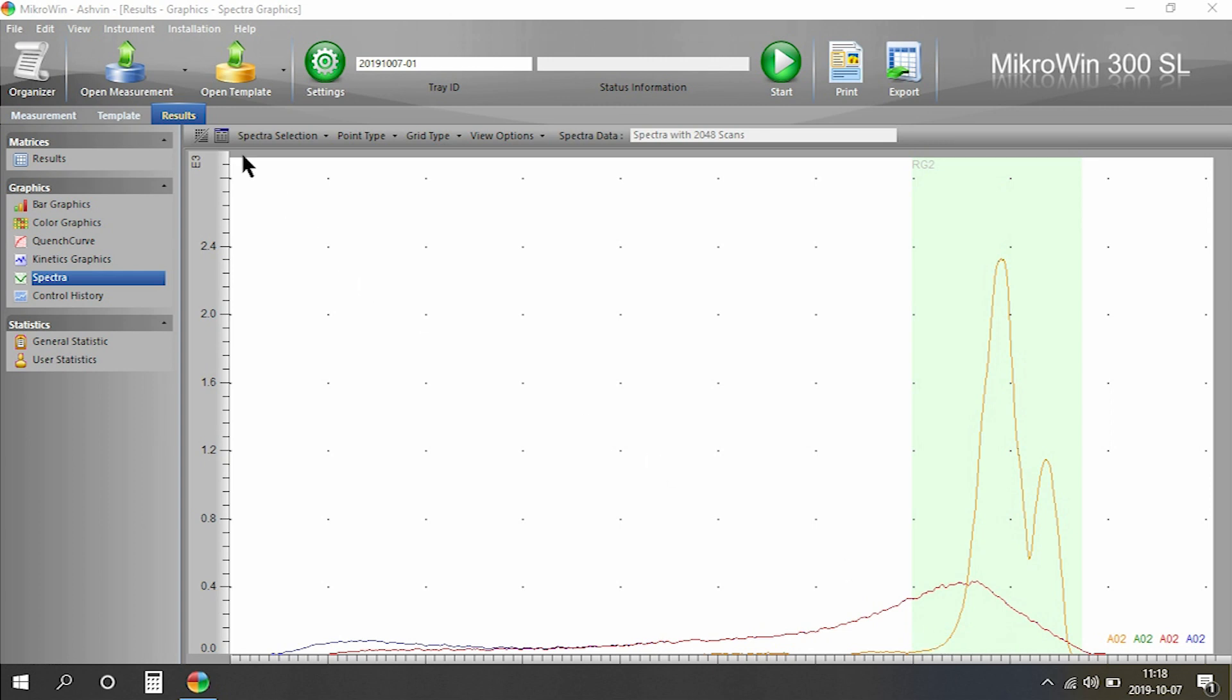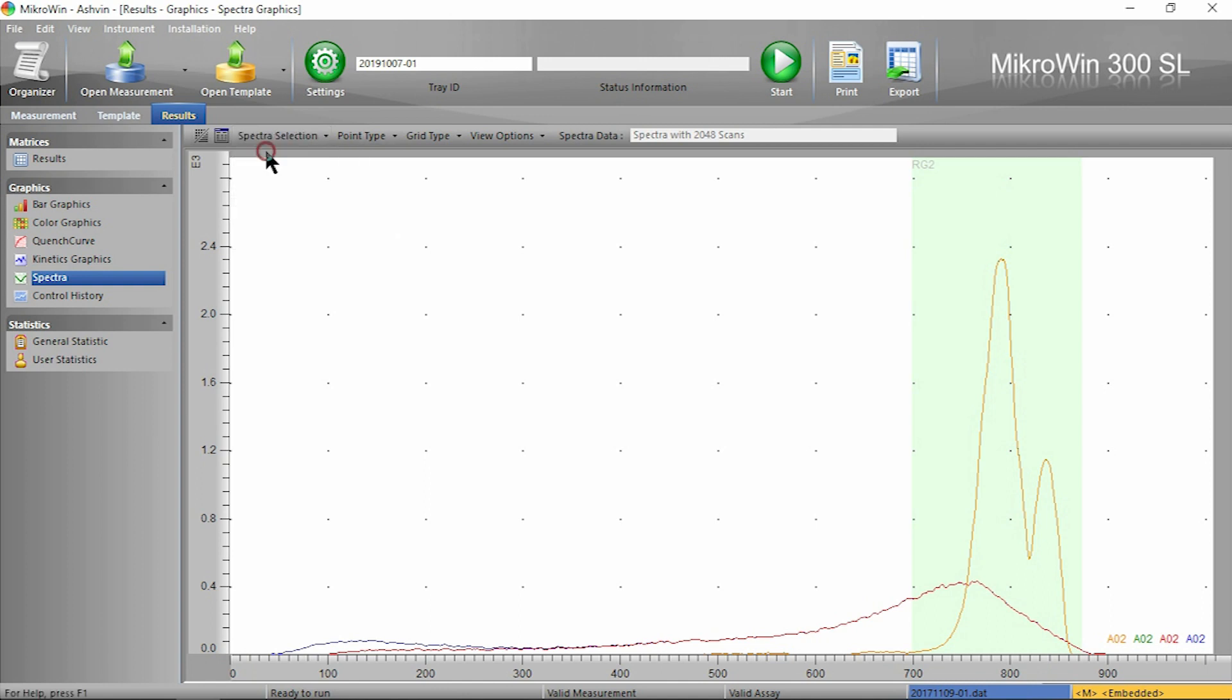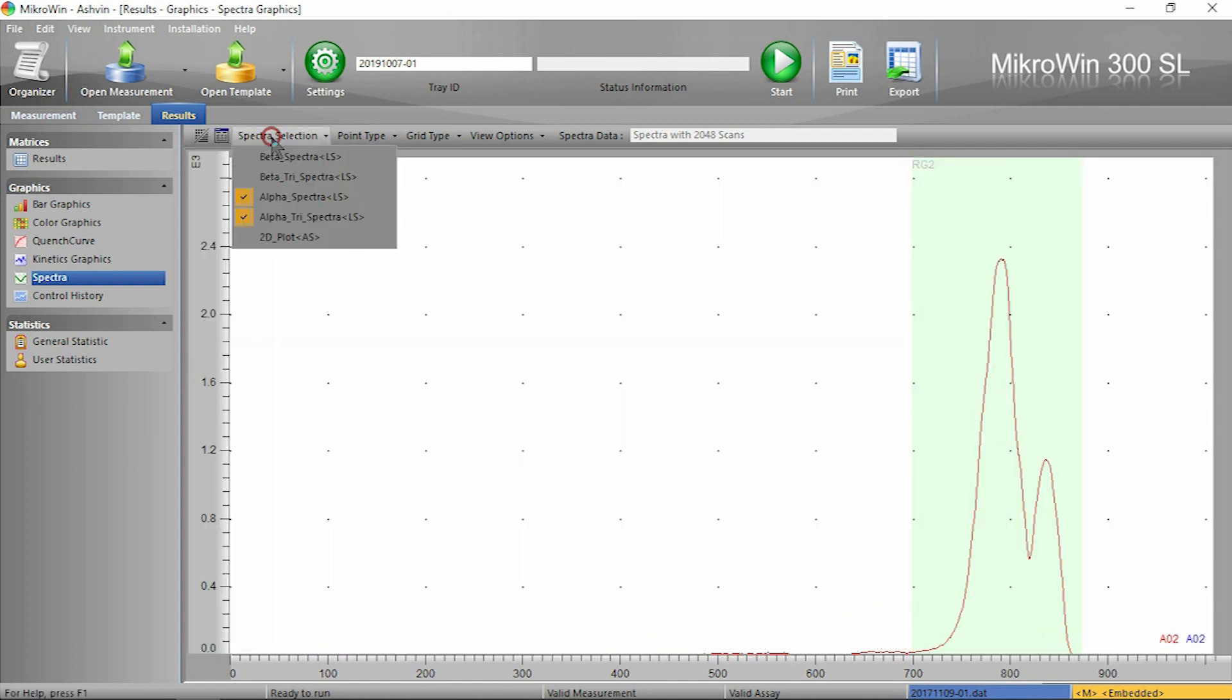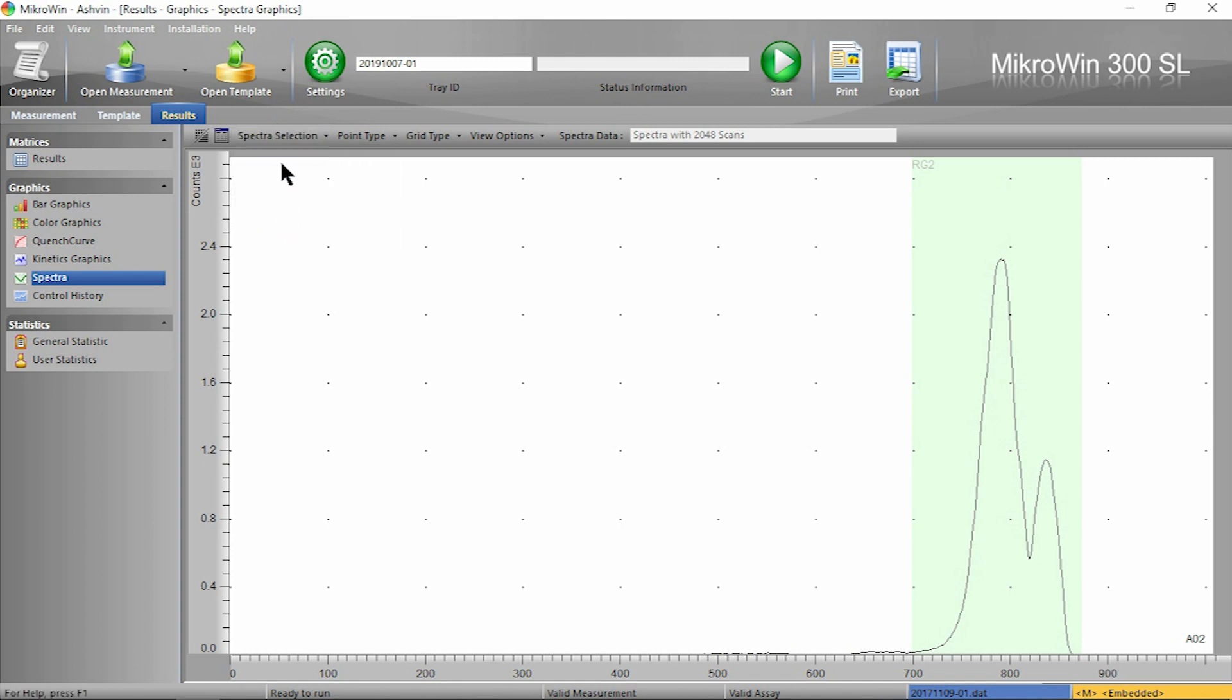The 300SL is unique in that it has a topographical 2D separation. You can view this by simply deselecting the other options and selecting 2D plot.